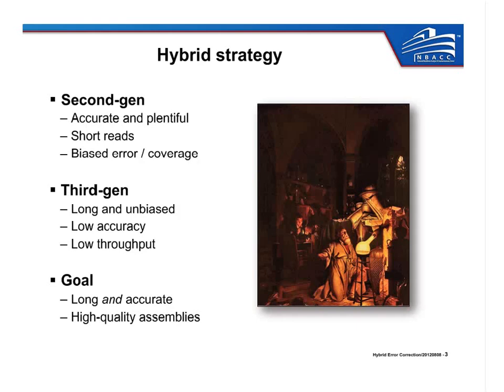In addition, because all of the second-gen technologies are based on amplification processes, there can be significant biases in both the error and the coverage observed. So that's our first basic element.